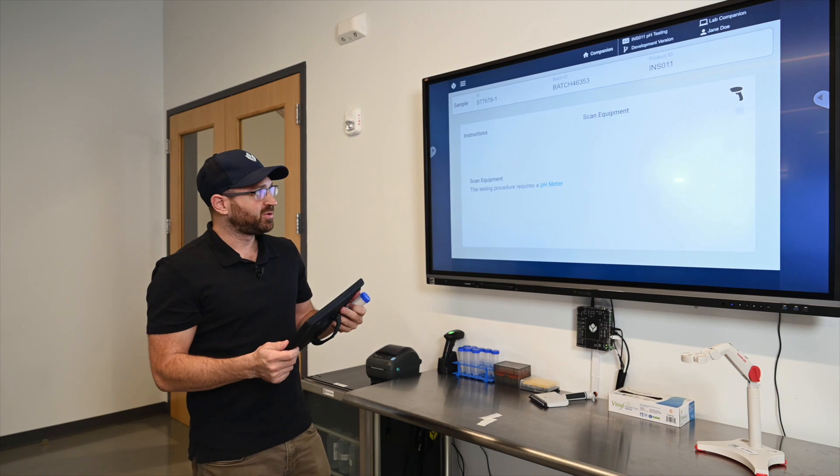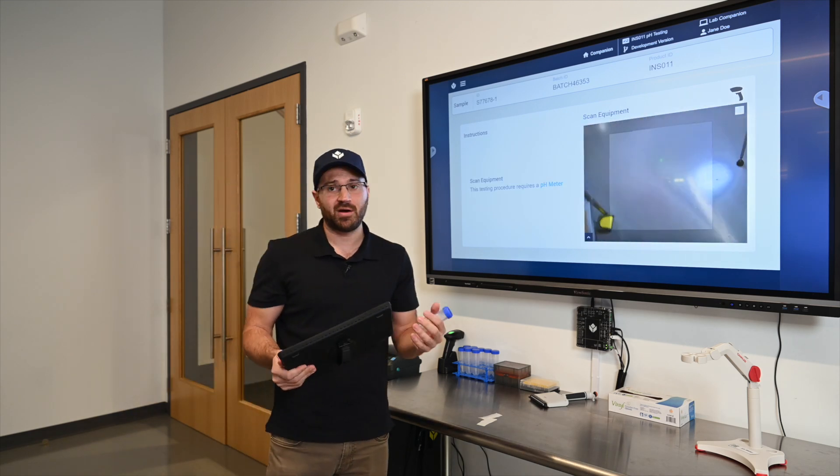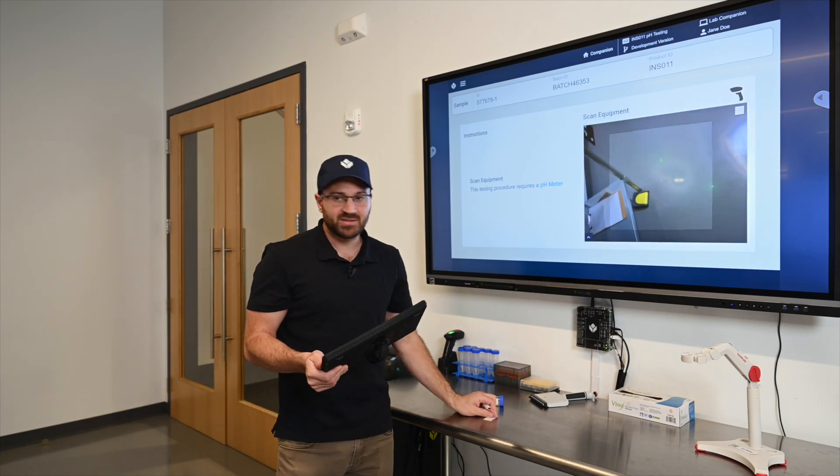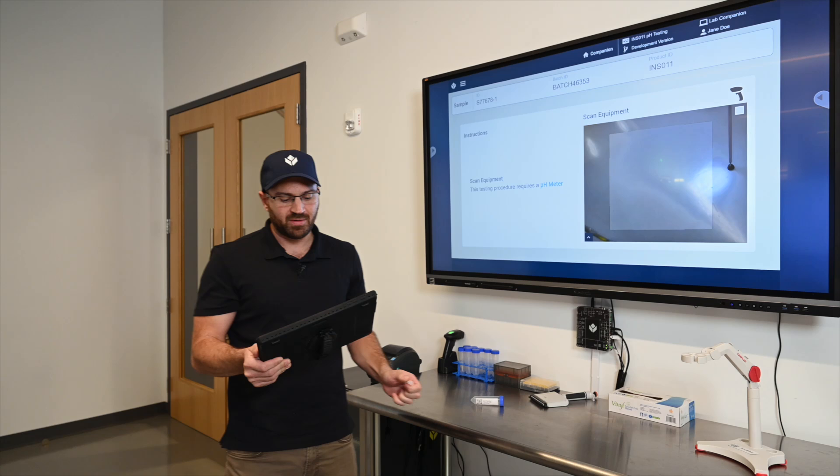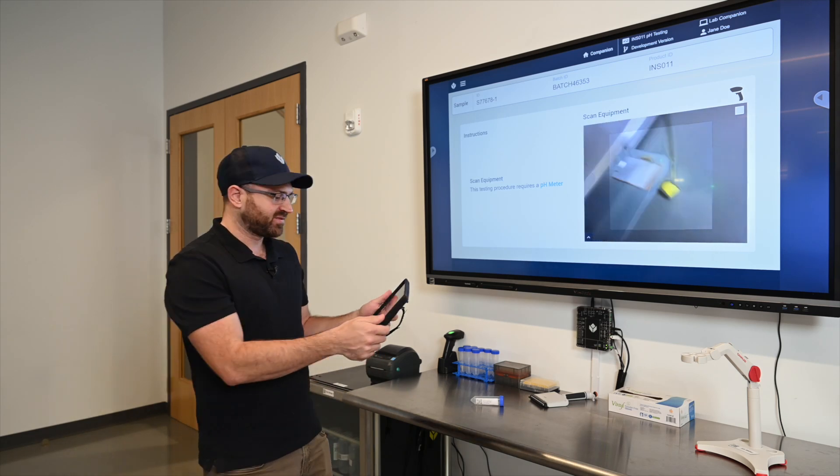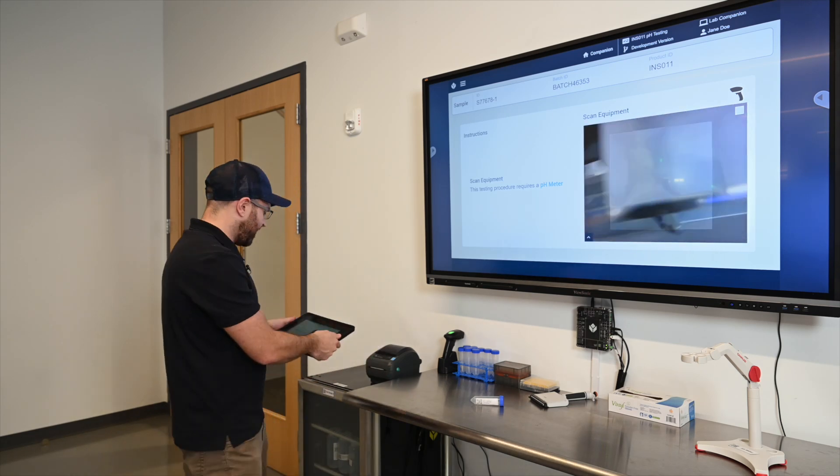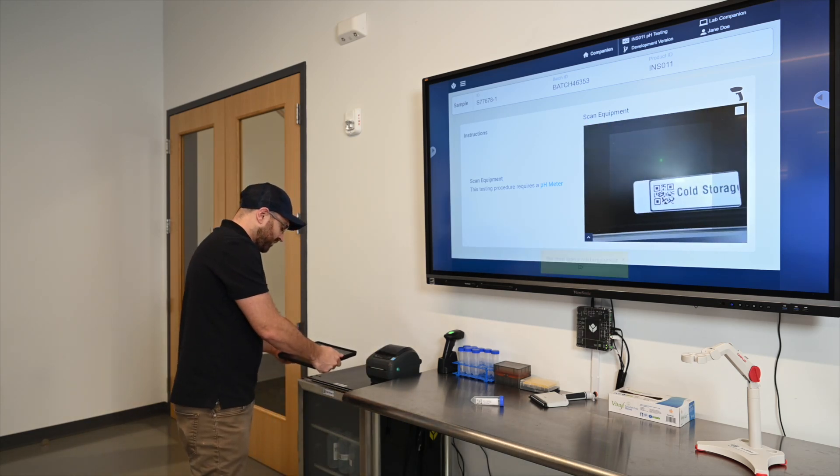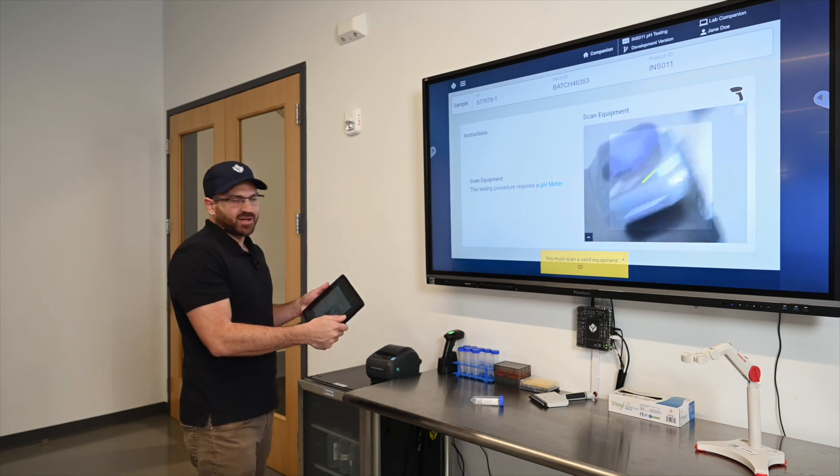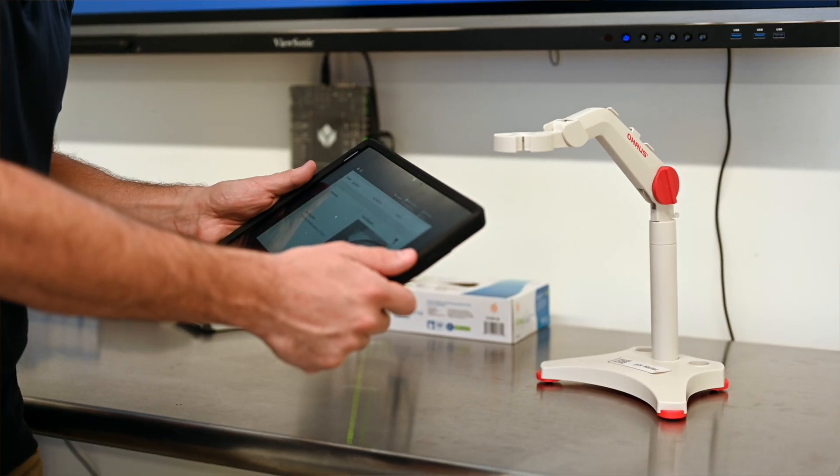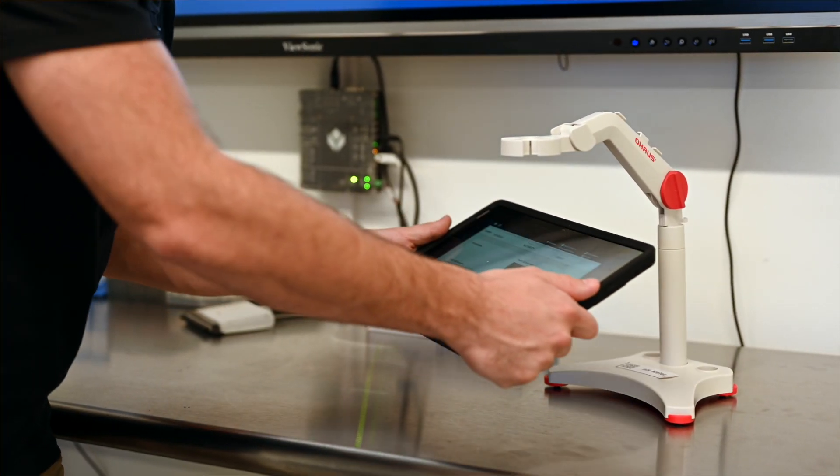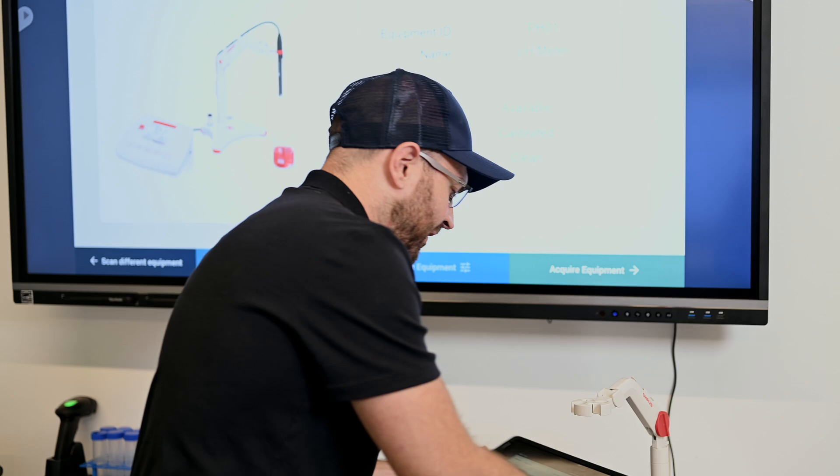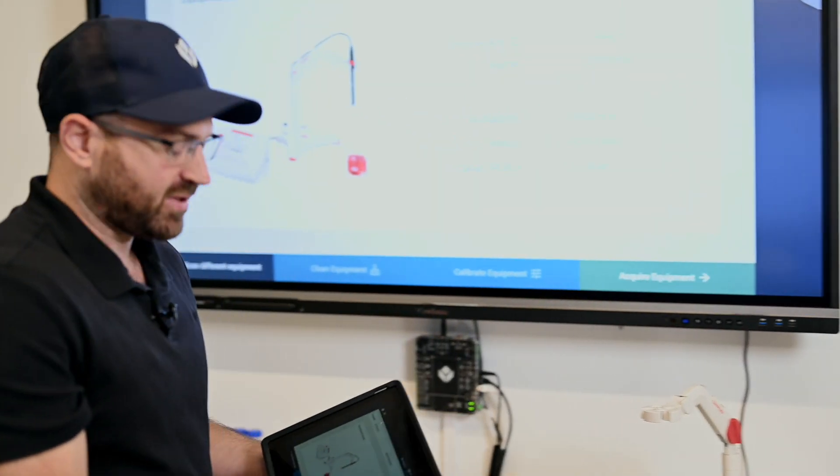To do the pH test I first need to acquire equipment. Now there could be many pieces of equipment available. I have to scan the right piece of equipment. For example if I scan the fridge it's not the right type of equipment. I have to scan a pH type. When I scan this meter I want to verify that I'm able to use it.